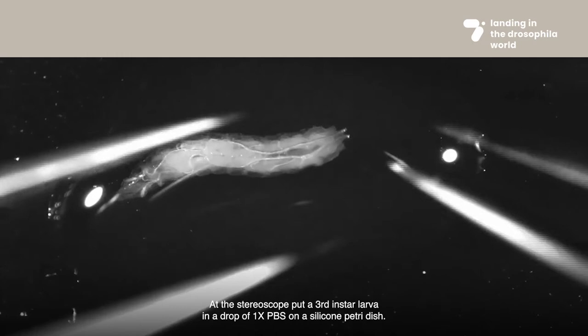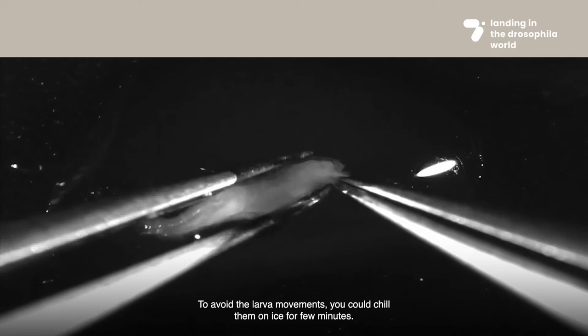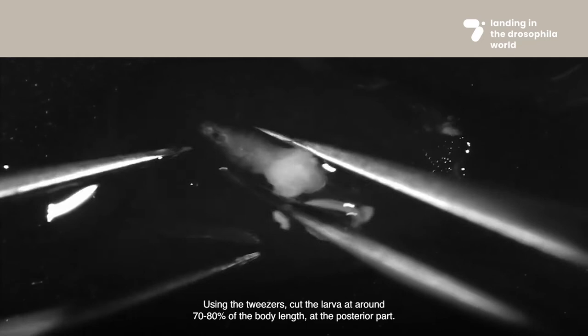At the stereoscope, put a third instar larva in a drop of 1x PBS on a silicone petri dish. To avoid larva movements, you could chill them on ice for a few minutes.